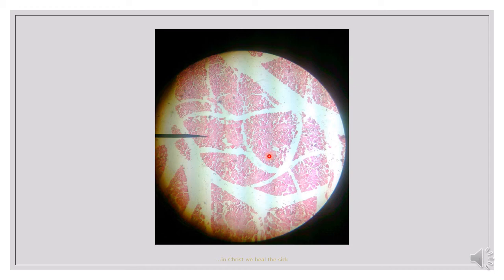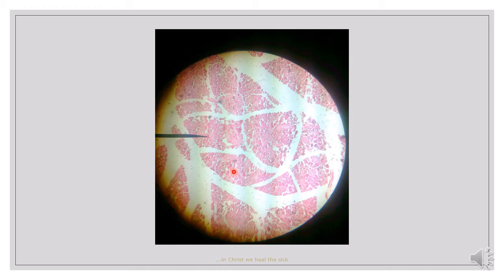This slide is the parotid gland. The parotid gland is divided into numerous lobules by connective tissue septa. As you can see, these are the septa and these are the lobules. Most of the ducts of the parotid gland are found in these septa and only a few can be seen in the lobule. When these ducts are seen, they are stained as deep as the gland or sometimes lighter.